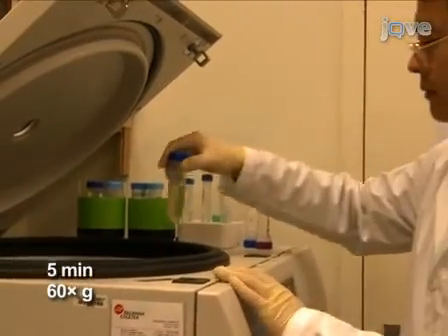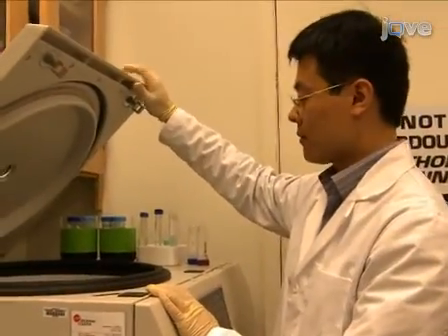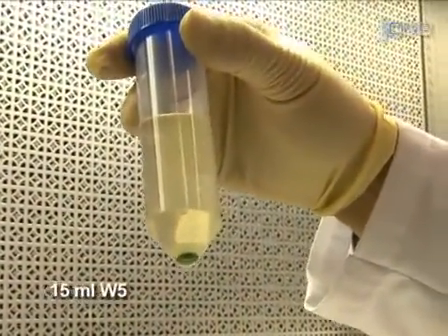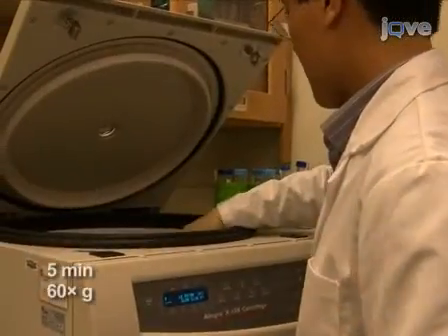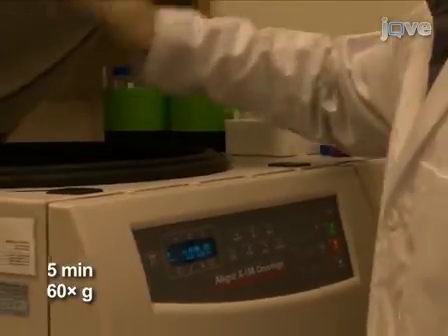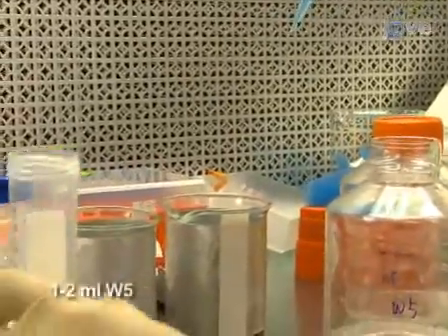Then centrifuge for 5 minutes at 60 g's. After centrifugation, remove the supernatant and resuspend the protoplasts in 15 milliliters of W5 solution. Again centrifuge the protoplasts for 5 minutes at 60 g's. After centrifugation, remove the supernatant and resuspend the pelleted protoplasts in 1 to 2 milliliters of W5 solution.